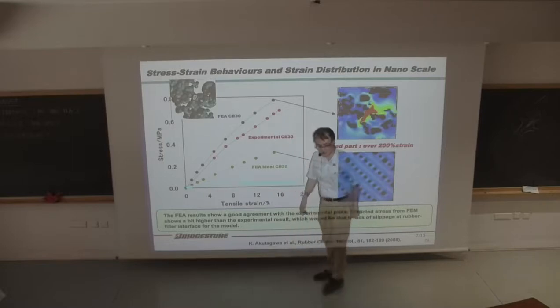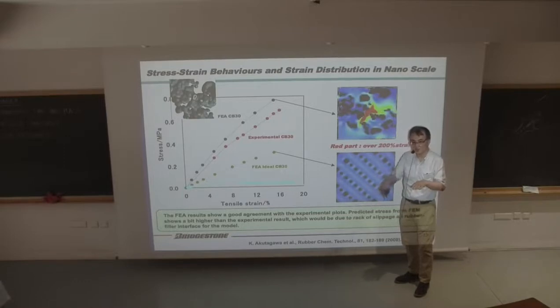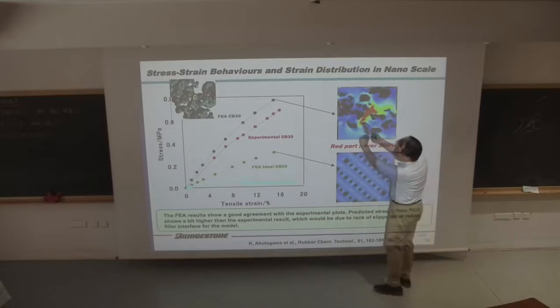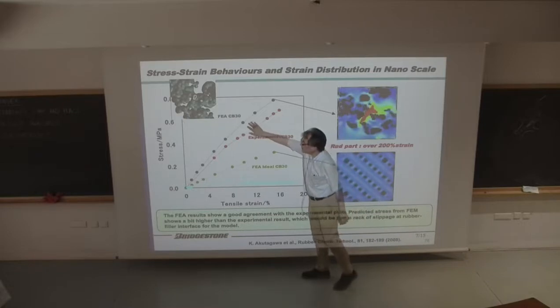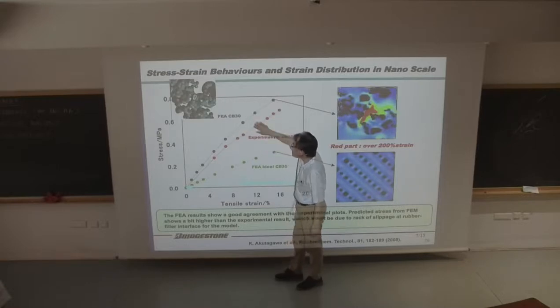Before this, they used two-dimensional TEM data to model their structure. So even though you know the aggregate size and the position, you don't know the depth direction. If you see a particle like this, it could actually be like this, or it could be even farther away. They don't know that. But with the three-dimensional image, you have this axis, the z-axis, too. Then after using this type of three-dimensional data and simulating, the result came out very nicely.